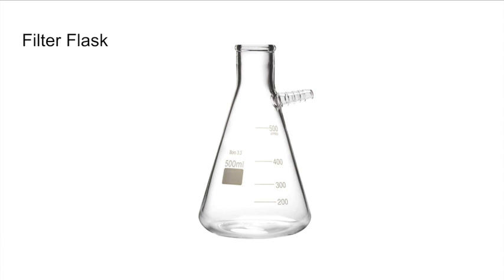Filtering flasks are used in numerous general laboratory procedures for rapid filtration of liquids. Typical flask design includes a conical shape with a flat bottom, tapered neck, and a sidearm for use in vacuum filtration. The flask is great for storing, mixing, and transferring various solutions due to its little sidearm. So cute!